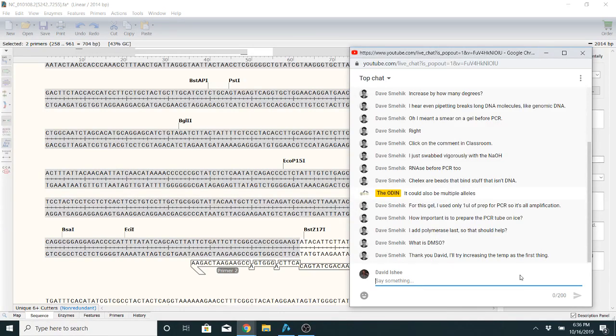And that's another thing. One issue I ran into: my first PCR machine was a used machine, and all my PCR reactions were garbage for a long time. I finally realized that it was slightly out of calibration, but it was like 12 years old. So it hadn't been calibrated in a long time. And if your machine is off by a couple of degrees, especially during the annealing temperature, that can make a difference.